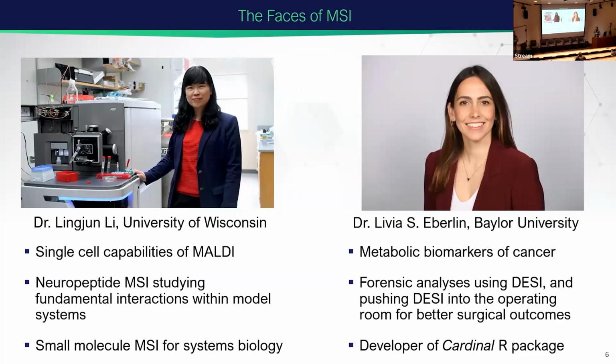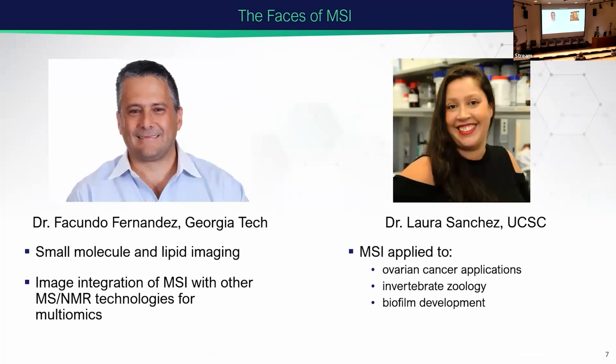Very creative. She's also a developer of a bioinformatics package I will talk about a little bit later that they use to process and analyze mass spec imaging data. Dr. Fernandez from Georgia Tech, he uses MSI to do small molecule and lipid imaging. He was one of the first to push this technology in that area. He does image integration as well, which I've mentioned before, of combining different technologies for multi-omics applications. In his space, he's interested in taking MSI and NMR and merging the two together.